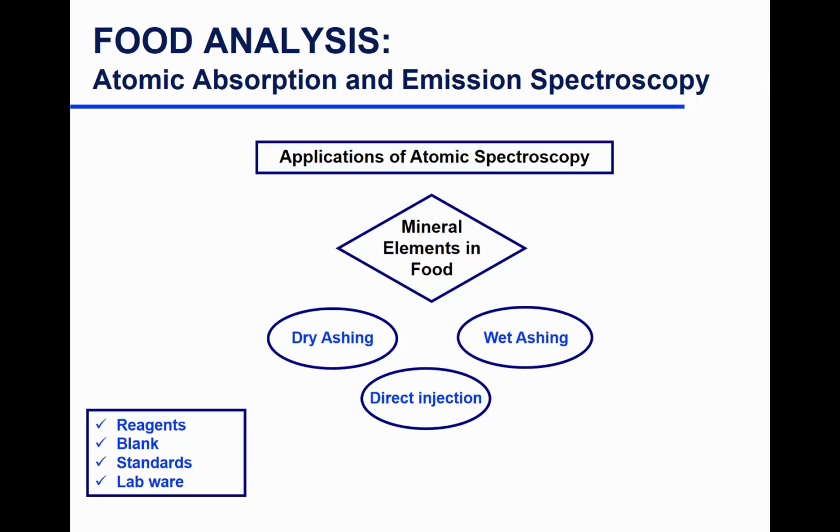So how do we prepare our samples for analysis? For atomic absorption lab, you already have your sample ashed for you. So the first step to determine minerals is you really want to release your elements from the organic matter. You can do that by dry ashing or wet ashing. Dry ashing is basically you put your sample in a muffle furnace at high temperature. At really high temperature, around 480 to 500 degrees C, all your organic matter incinerates, so oxidizes.